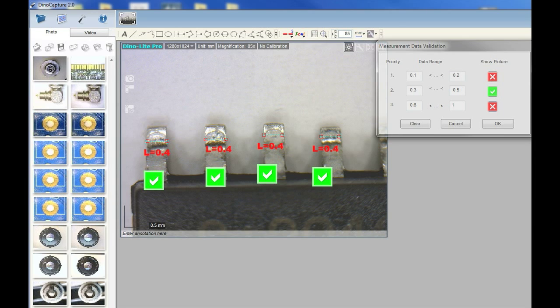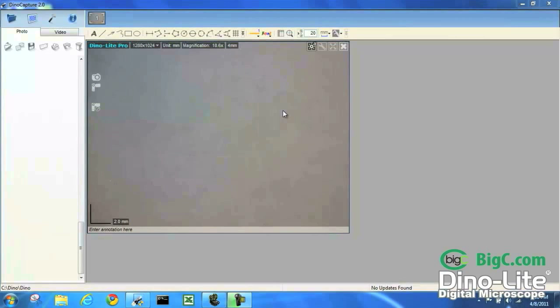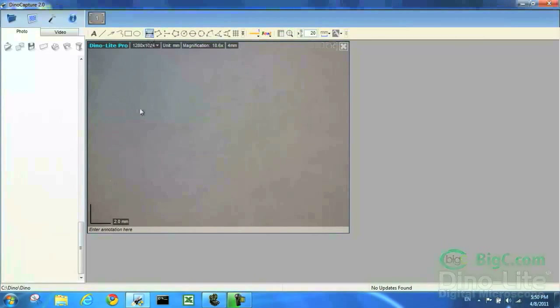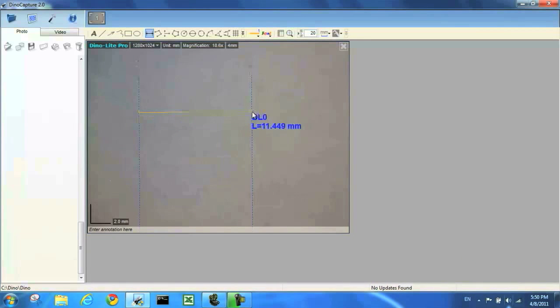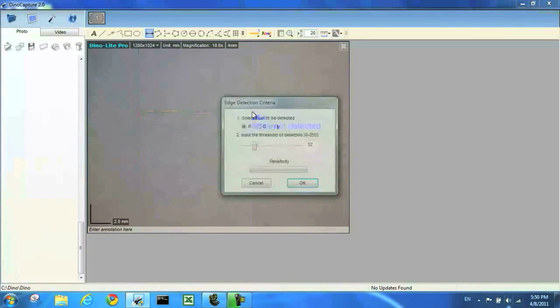The first thing I'm going to do is draw a nice straight line holding down the control button on the keyboard to tell Dino Capture this will be an edge detection line.